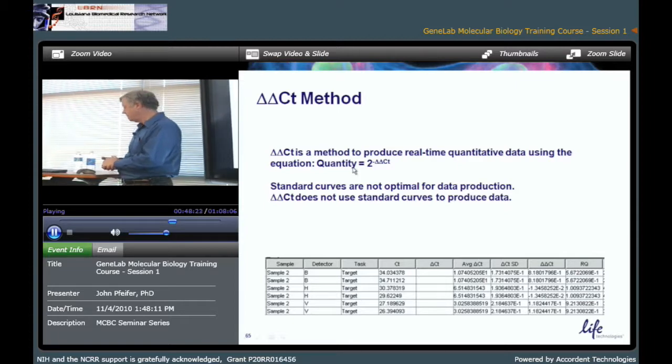So in a real-time setting, if you were to obtain absolute quantities of a viral genome, how would you go about doing that? Great example. Allow me to ask you a question so I can tailor the assay to your application.